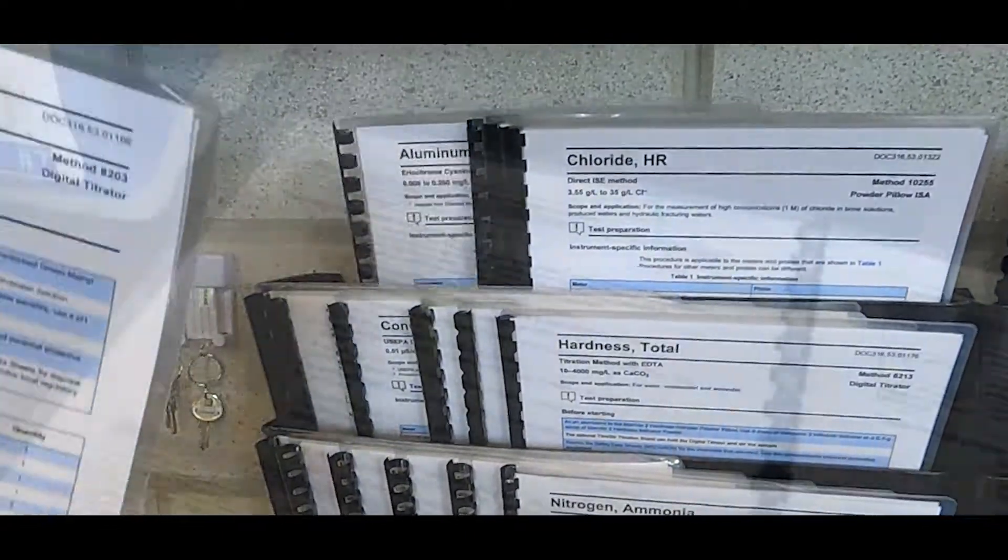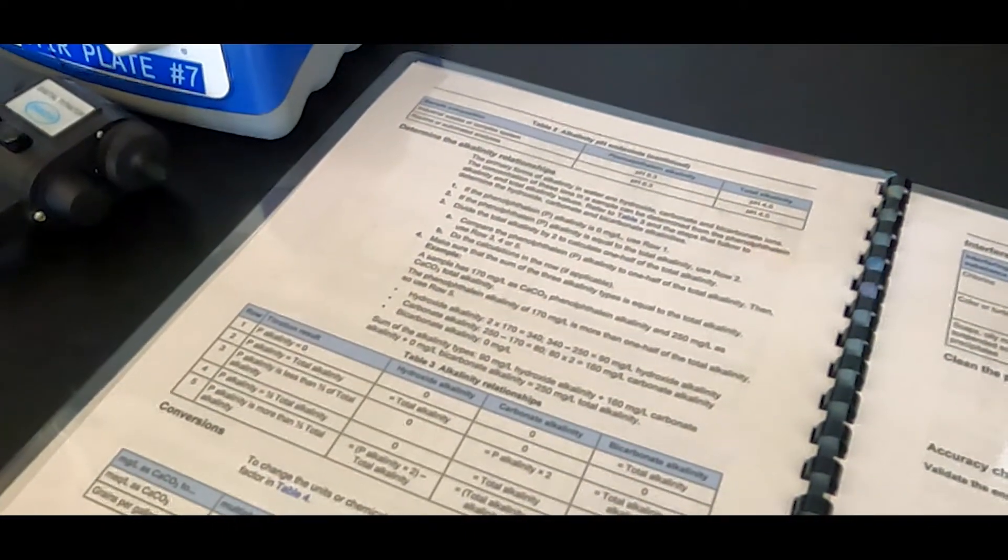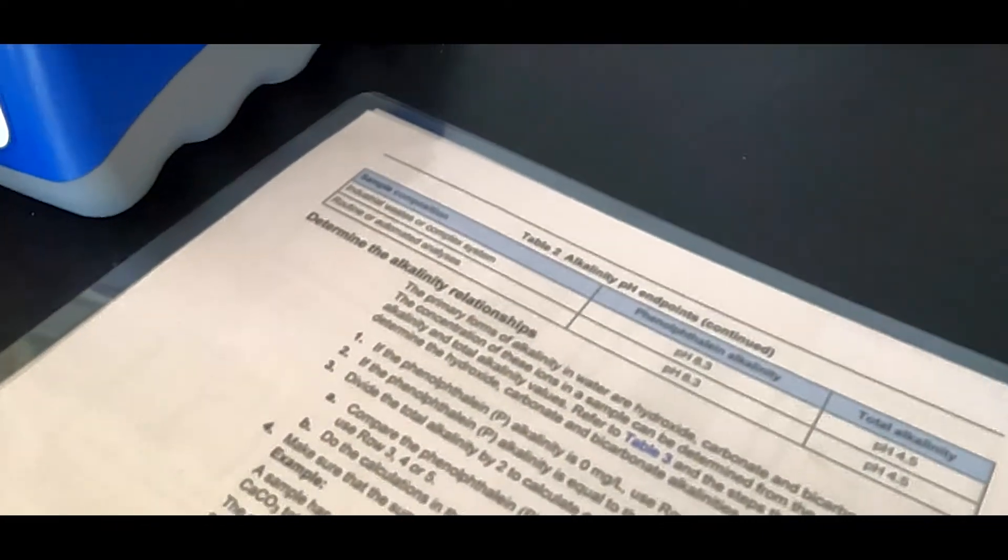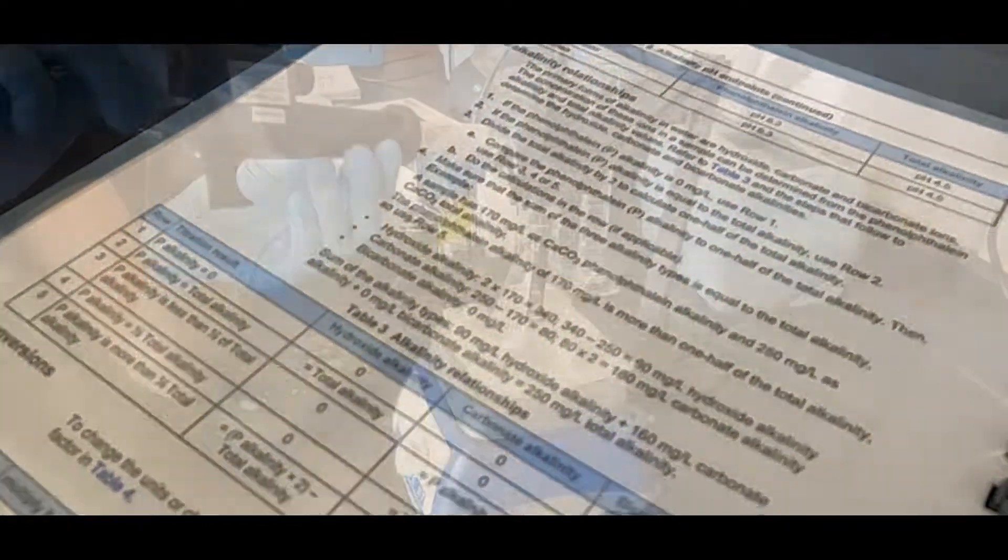Information for determining the alkalinity relationships and calculating the bicarbonate, carbonate, and hydroxide alkalinities can be found in the method if it is required.